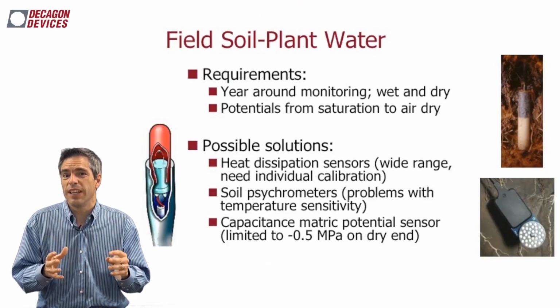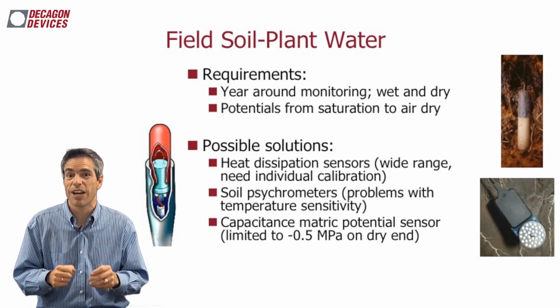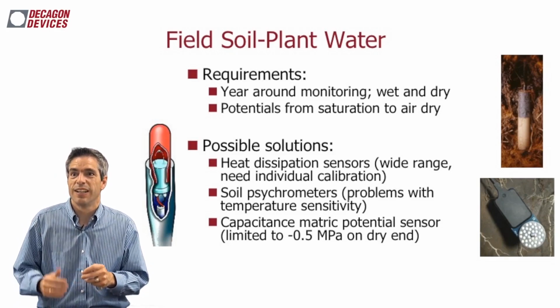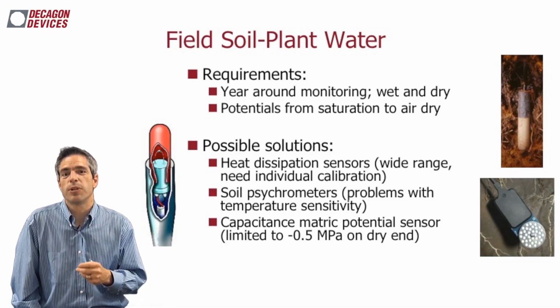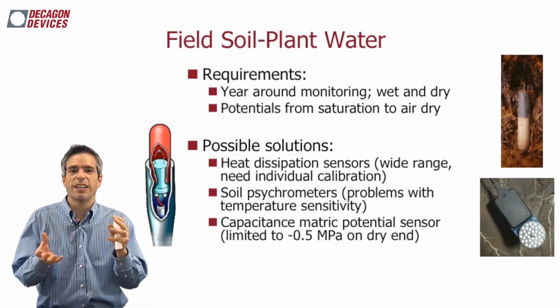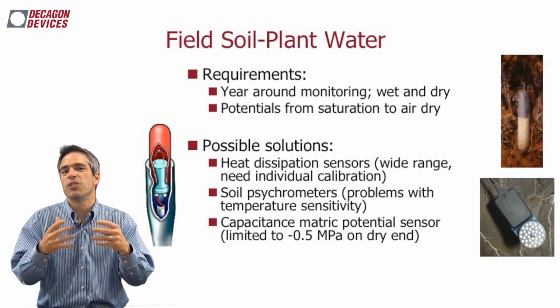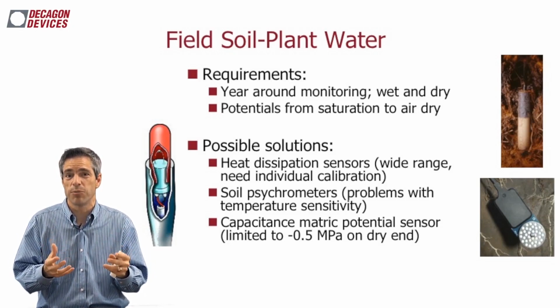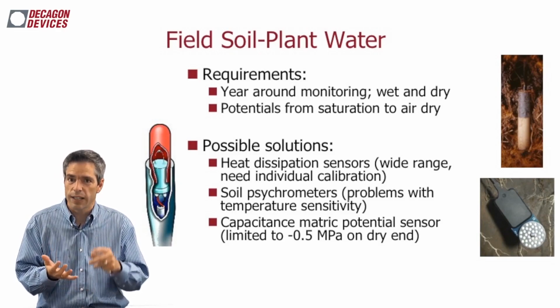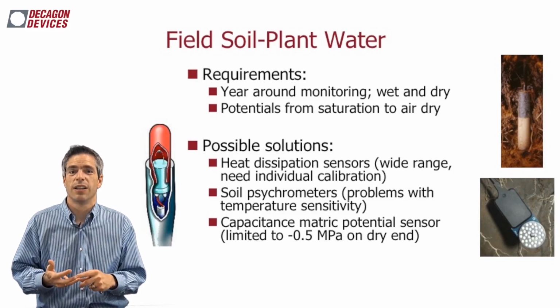Now, let's jump into a couple of other applications before we finish this. We're running short on time, so we've got to just move on. What if you're wanting to measure the water potential of soil in the field? What choices are you going to use? Well, I kind of threw up a few. Generally they are related to the solid matrix equilibrium techniques that I talked about first. Why? They're inexpensive and they require pretty low maintenance.